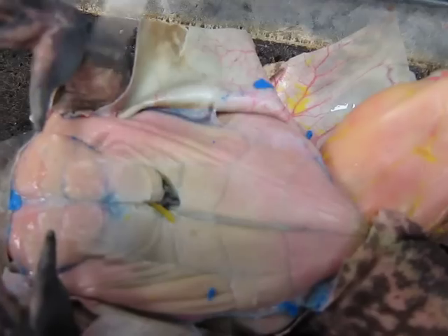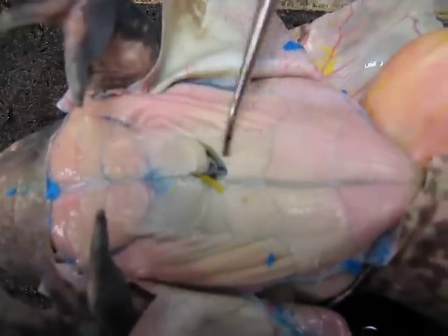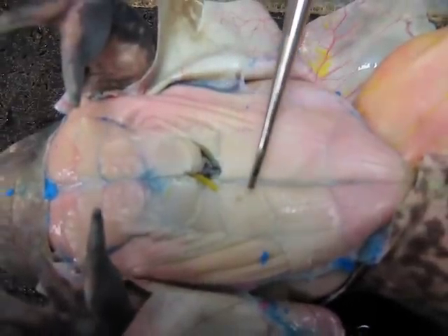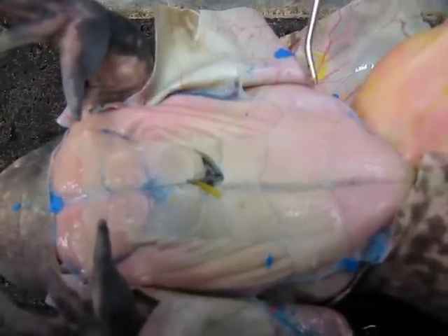Moving up, this middle line is called the linea alba. The abs of it are called the rectus abdominis. This muscle on the side is the external oblique.